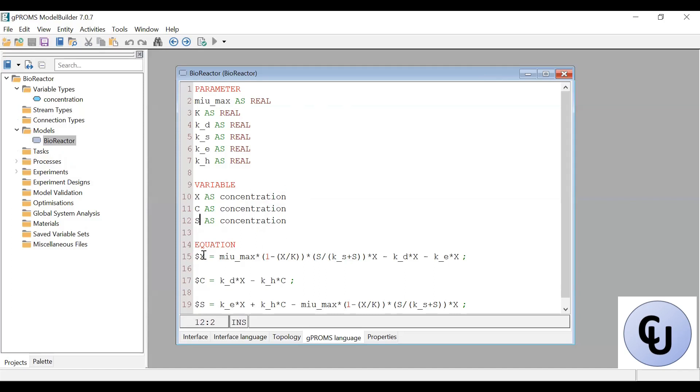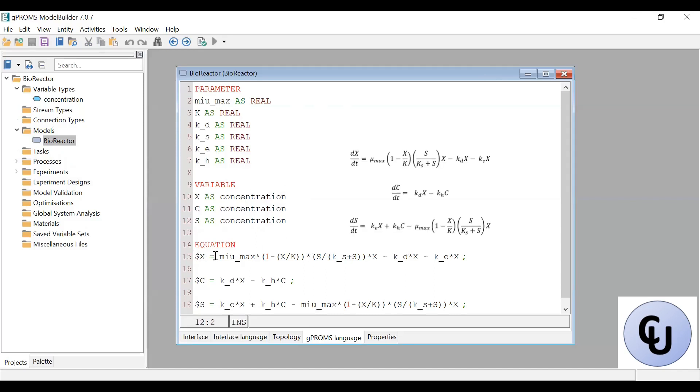And the equations — this is the first equation, the second equation, and the third equation. So these are differential equations.